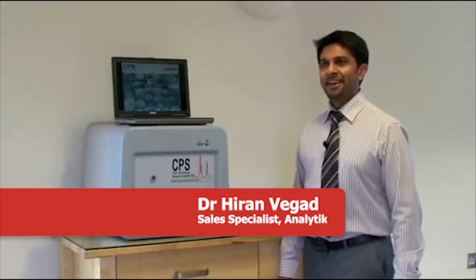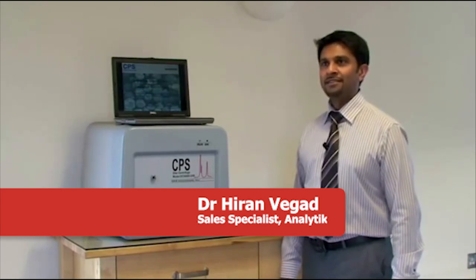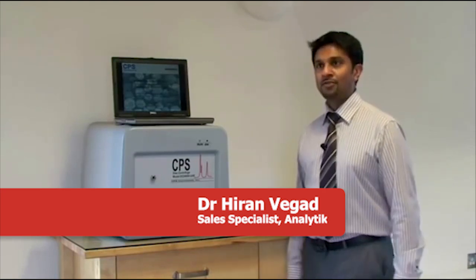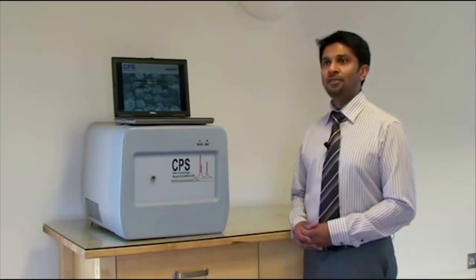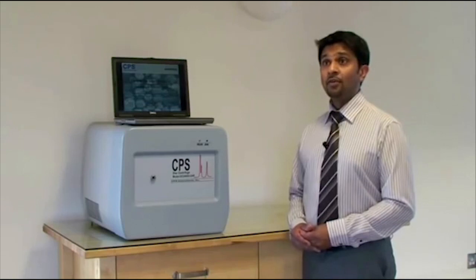Hi, my name is Hiran Vigad and I'm the product sales specialist for the CPS Disc-Centrifuge UHR machine. The UHR stands for ultra-high resolution and this instrumentation is used for high-resolution particle size characterization using a technique called differential centrifugal sedimentation.